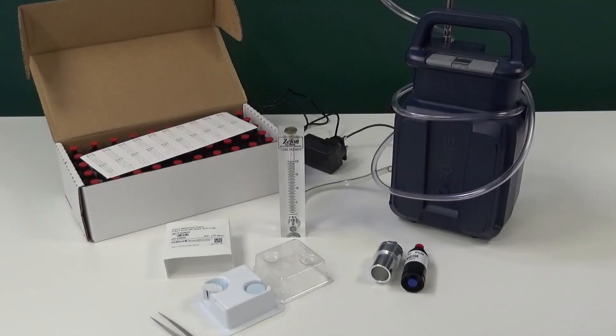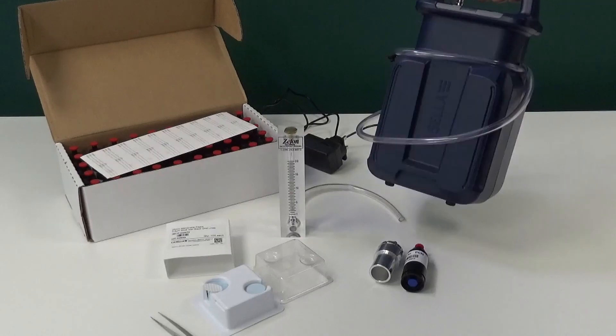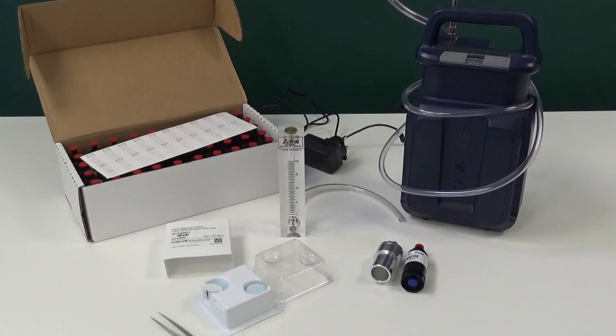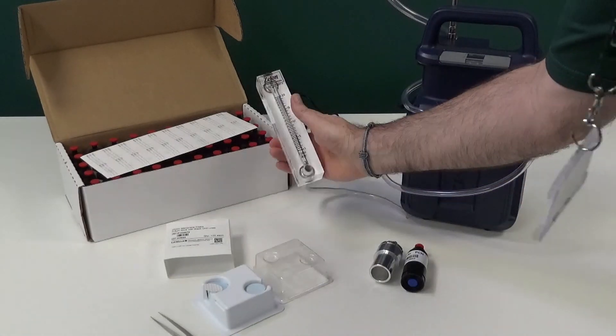The parts required are the Vortex 3 high flow air sampling pump, which has a flow rate between 5 and 12 litres per minute and a maximum run time of 2.5 hours at 12 litres per minute and 4 hours at 8 litres per minute. A rotameter to confirm the calibration of the Vortex 3.